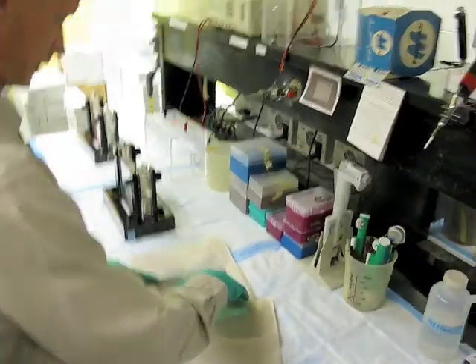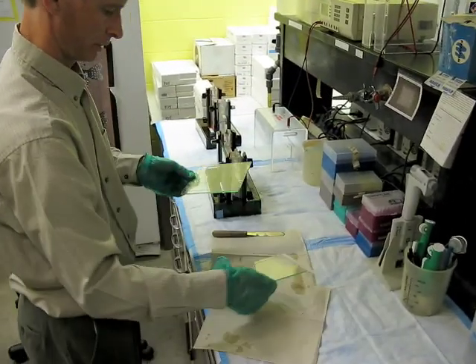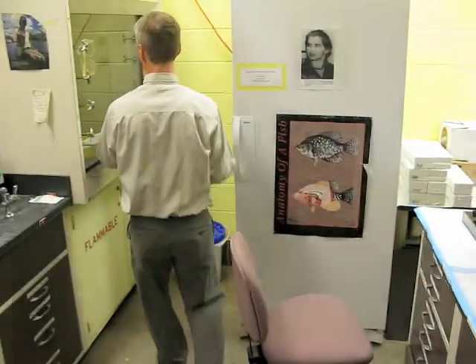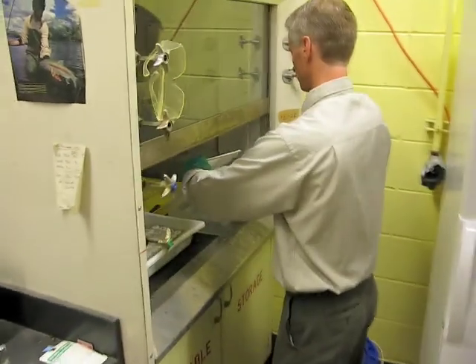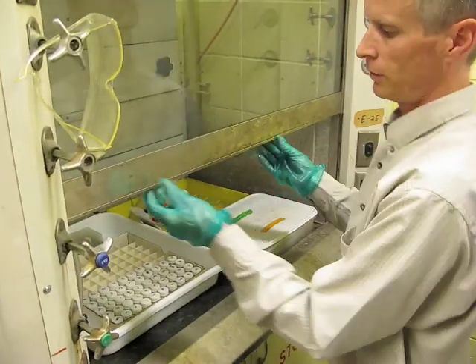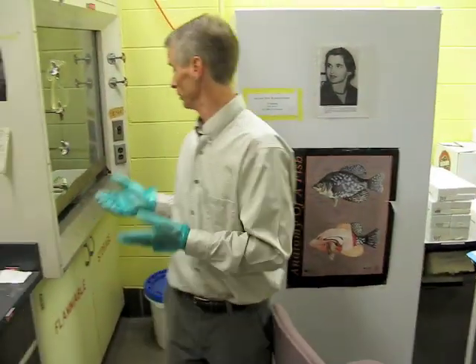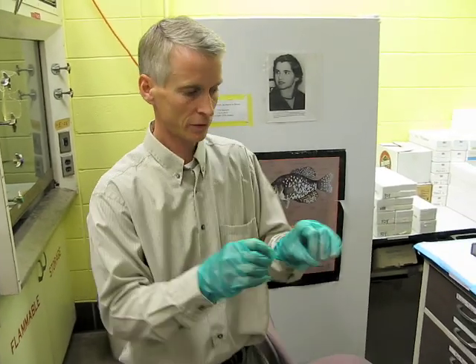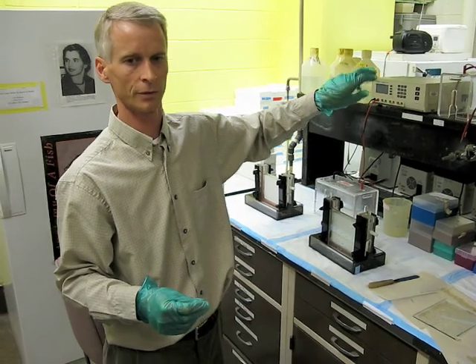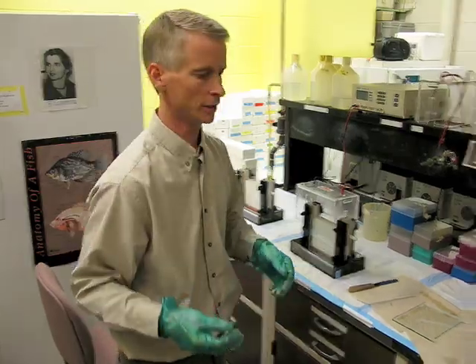The actual gel material is sandwiched in between a couple of glass plates. So I'm going to separate the two plates, and this now goes back in a stain. We'll have to sit and wait 5 to 10 minutes, because the DNA in the gel is going to pick up a chemical called ethidium bromide. It sticks to DNA, and then we're going to take it back to another room where there's an ultraviolet lamp, and that dye fluoresces under UV light.